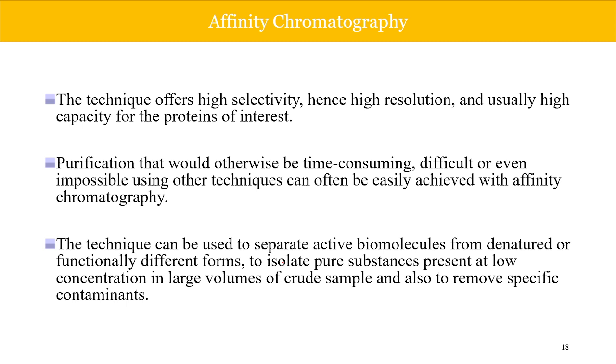And the purification that would otherwise be time consuming, difficult or even impossible using other techniques can often be easily achieved with affinity chromatography. This technique is used to separate your active biomolecules from your denatured or functionally different forms, to isolate pure substances present at low concentration in larger volumes of crude sample, and it will also help you to remove specific contaminants. So why is this affinity chromatography important?